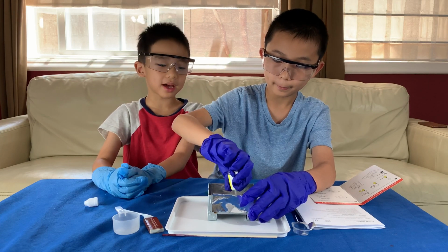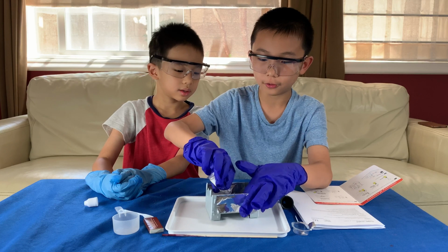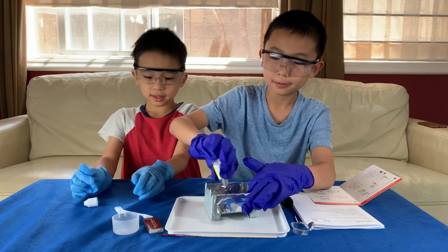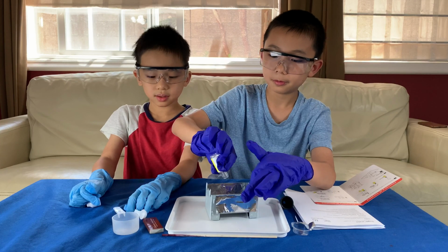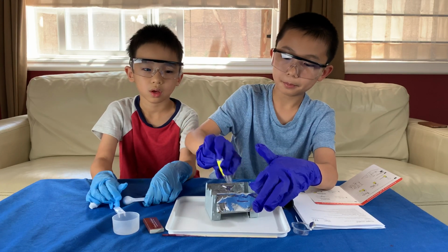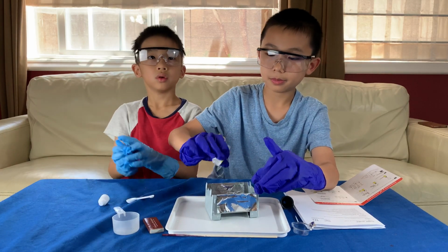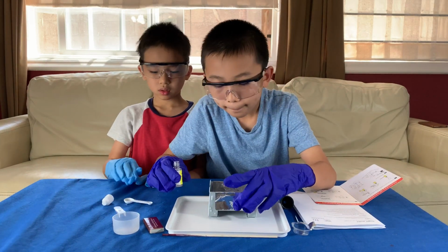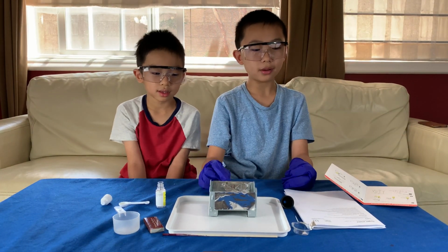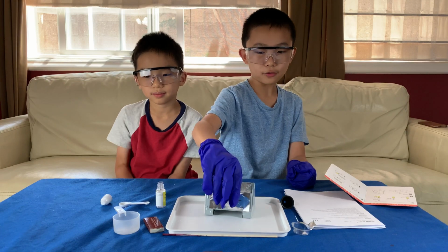Like we haven't lit up the match. Yeah, that's supposed to happen when you pour. Okay, so it's a bit of an overflow. That's supposed to happen. And go. And now we have completely prepared the sugar snake. We have the fuel tablet here, the sugar and the baking soda poured in, and the stove all ready.